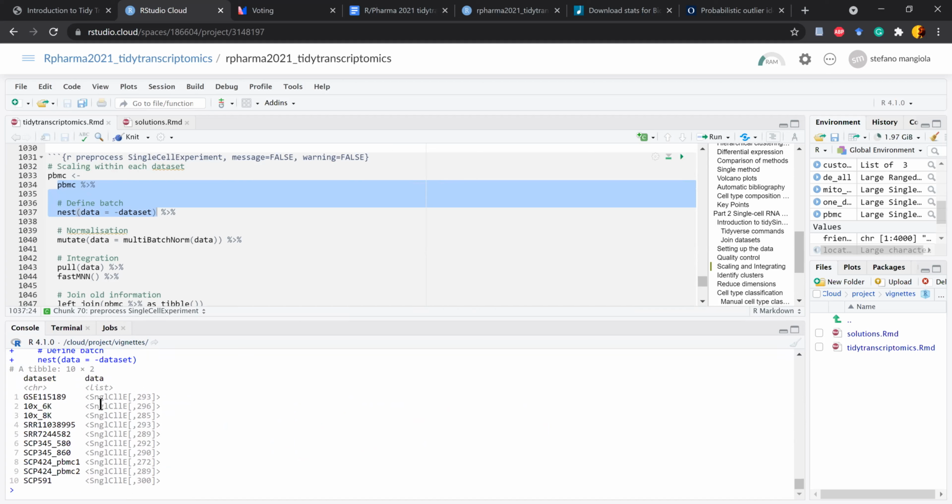I show you simply here that the metadata we have added back to our data set is simply our data set transformed as a table. And again, we left join this table to our data set. And so the result is a data set that has the information as before, but also has some reduced dimensions that are corrected. By default, the first 5 are displayed for us. And these are the dimensions where all cells have been integrated together in a common space.